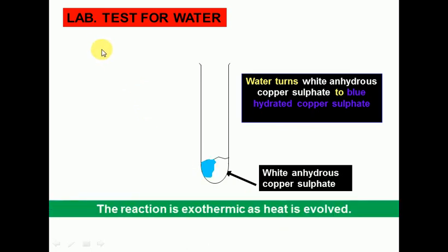Let us discuss the last test for the detection of water. When we perform experiments in the laboratory, we come across the use of various chemicals in the beaker, and when there is more than two beakers having different chemicals, and if we are having a confusion that in which beaker there is a water, to overcome that confusion, we perform this simple test.